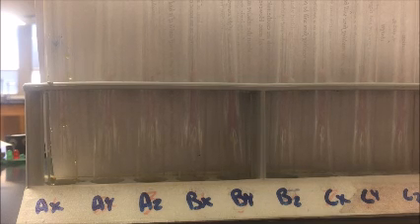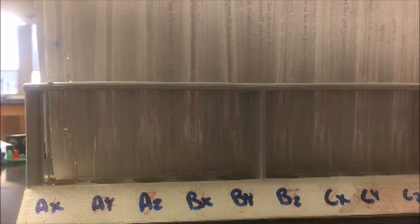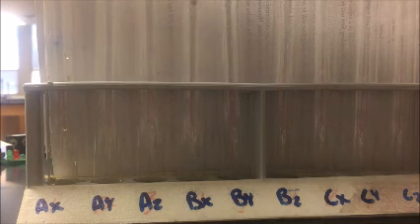Now I'm going to put some of compound B into the BX, BY, and BZ test tubes.